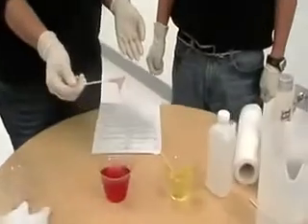So it's a little bit messy, but in the end, the goals of this are to show students that you can use household items, everyday items that you can buy in a grocery store to do things that scientists do in labs or from crime scenes all the time, and that it's easy to do and sort of fun.